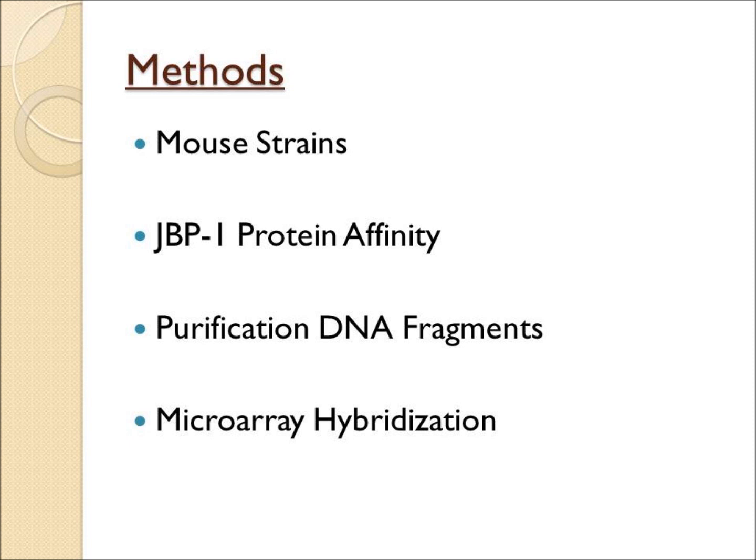The DNA was further incubated for 2 hours at room temperature with capture beads, which were magnetic and contained the JBP1 protein. The beads were washed in buffer before being immersed in the elution buffer provided. Purification of DNA fragments. During this process, DNA was extracted from frozen at -80 degrees before purification, and an average of 500 bp was fragmented.